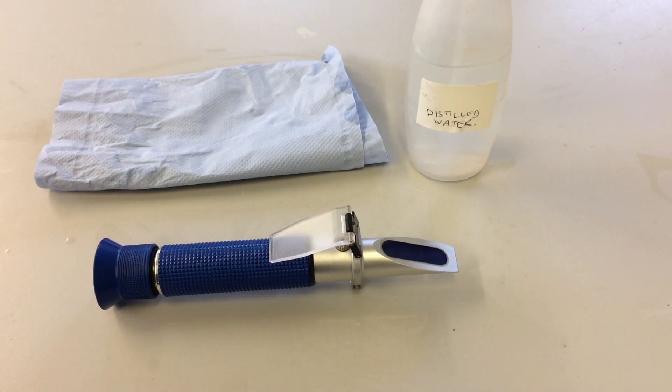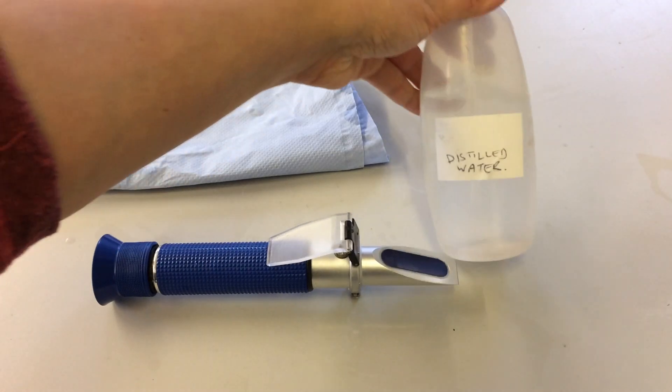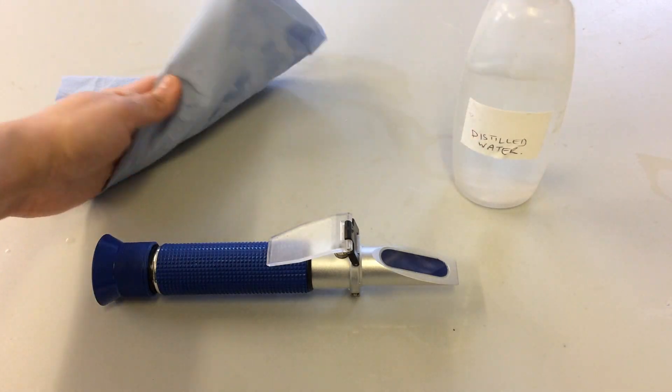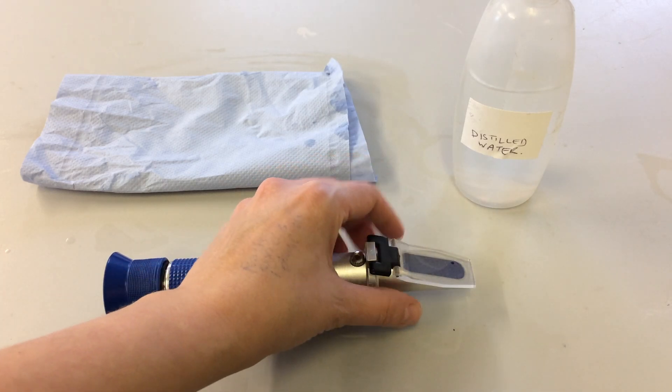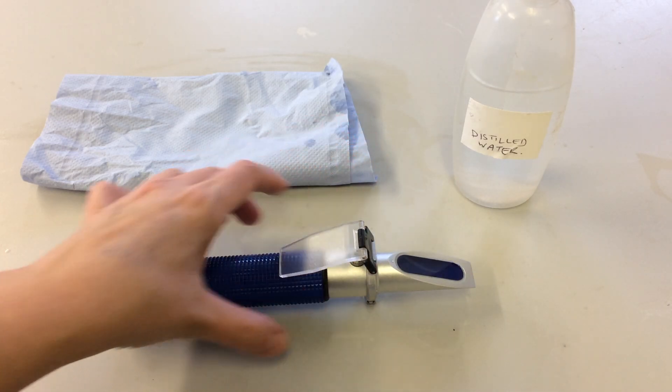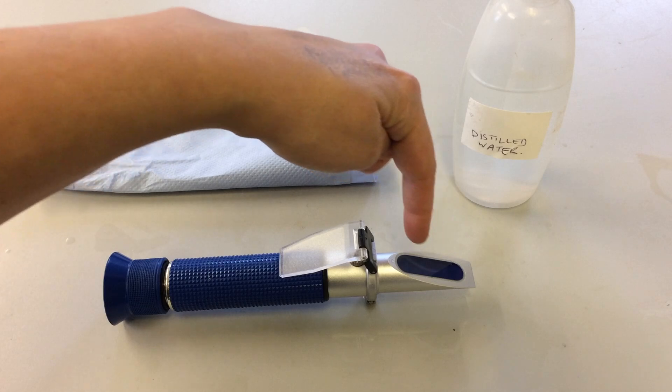So using the V2 refractometer, I'm going to show you how to calibrate your refractometer before you measure your seawater sample's salinity levels. First, you need distilled water, a bit of lab tissue, and obviously your refractometer. We're going to lift this cover plate and place our sample onto this section here.